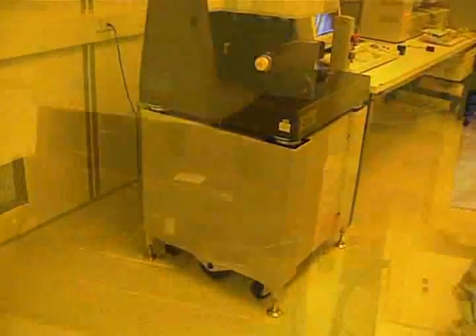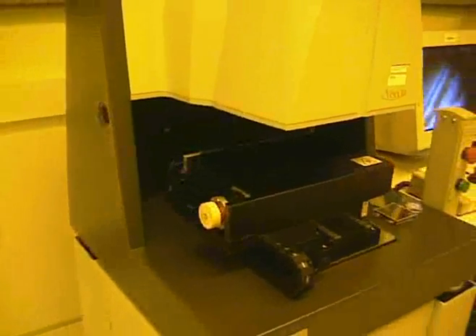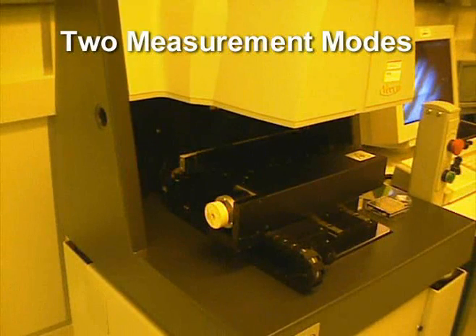Wyko Profilometer is an optical profiler. It uses non-contact interferometry for surface topography measurements. The profilometer offers two different modes for measurement.